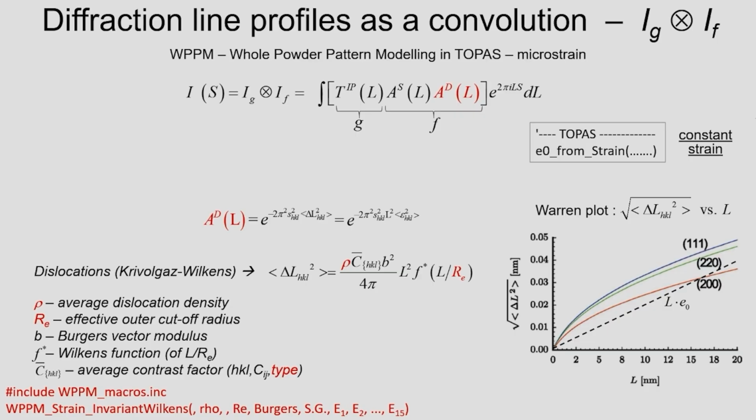Now, I don't want to go into details, but you clearly see that the trend is not a straight line. The straight line comes from this uniformity assumed in the Williamson-Hall method and in the double Voigt method. So it is not that it's completely wrong, you see, not totally different, but the details are different, and the details, I think, are important. Okay, you want to be convinced about this approach? I'm going to show you an example, and then we also run some examples together, or step by step at least. But let me show one little demonstration.